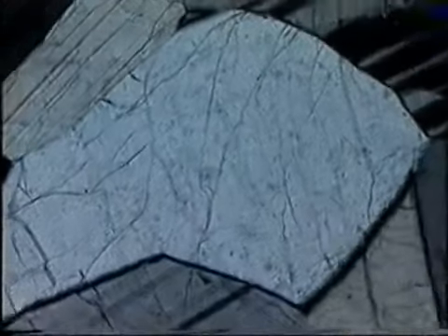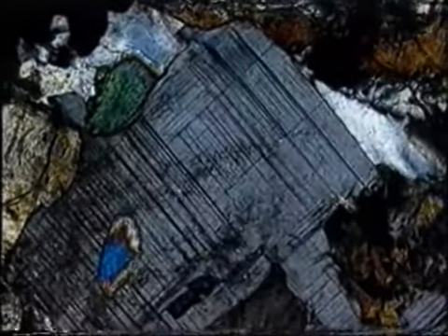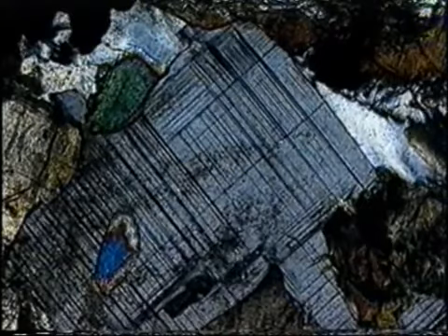Multiple albite twinning is not evident in grains cut parallel to 010, but do not identify these as alkali feldspar. This is combined albite and Carlsbad twinning. Another set of multiple twins called pericline twins can cut across the albite twins. The effect is similar to the crosshatch twins in microcline, but is more regular, as in this close-up view.